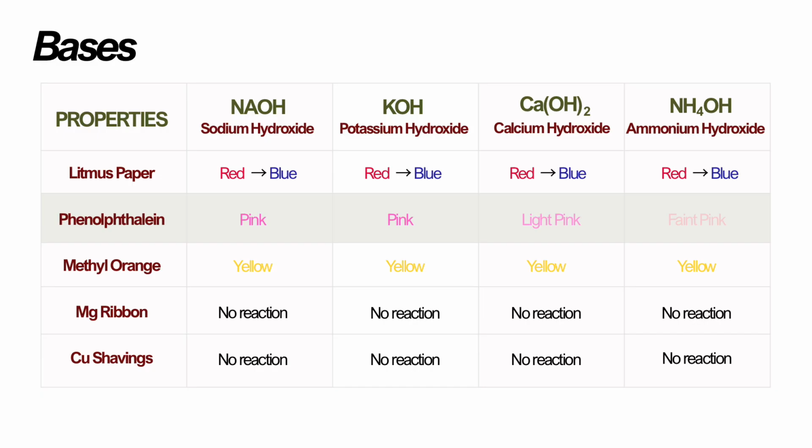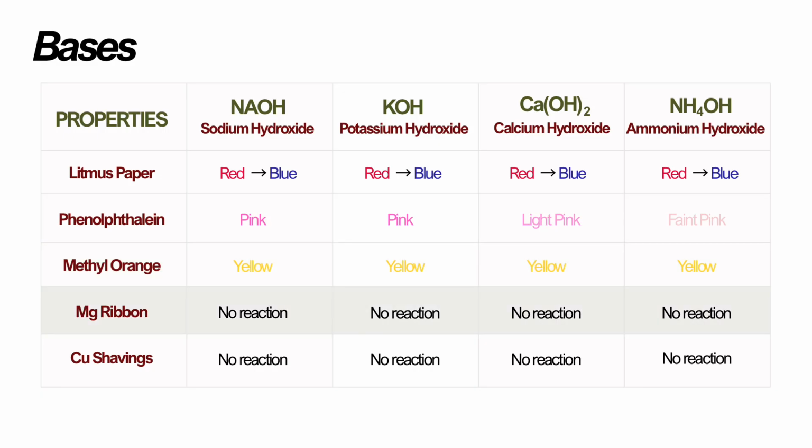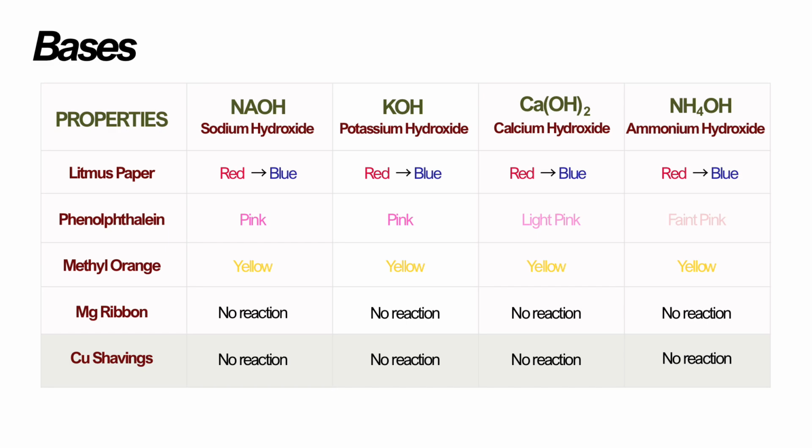And for ammonium hydroxide, it's a faint pink. So next is the methyl orange, reaction with methyl orange. It's just the same for all bases. It turned into yellow. And lastly, for the magnesium ribbon and the copper shavings, for all bases, there is no reaction. So that's it for the bases.